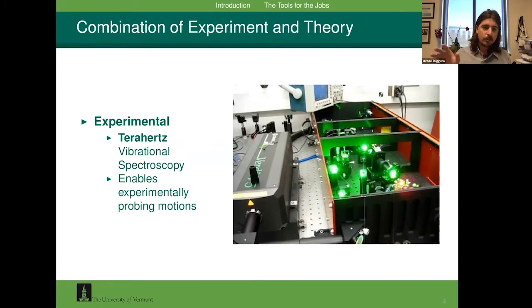One is a custom one where we can build an experiment to have any sort of utility that we need. That's one aspect of our research, actually building new instruments, new sensors, new devices. And then we also have some commercial spectrometers where we literally throw anything in the beam and we can get data in seconds. So we have a really nice toolkit.